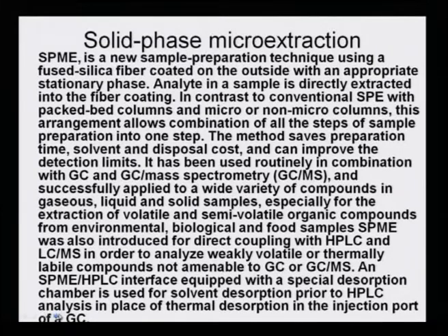Even it can be connected to HPLC, where it is interfaced with a chromatographic machine, so that it can be separated and used further on. So, the extractant is directly connected to that. Main advantages of solid phase microextraction.